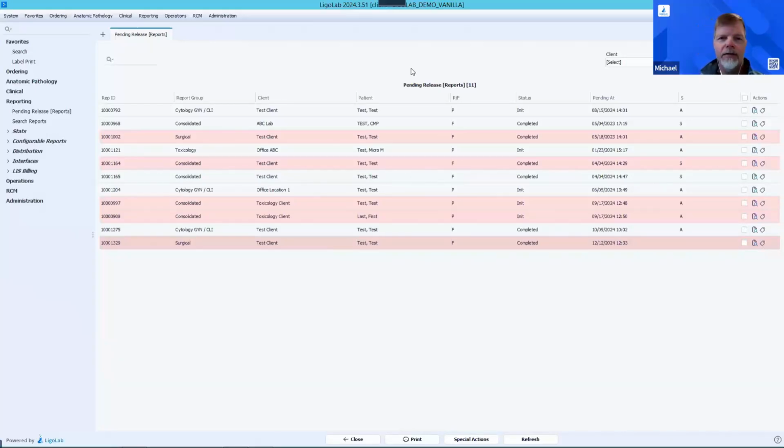I thought also case assignment was an interesting one. Maybe we can talk a little bit more, Allison, about case assignment, when it would be used and how it actually works. It makes sure workloads are equalized for pathologists staffed within that pathology group.